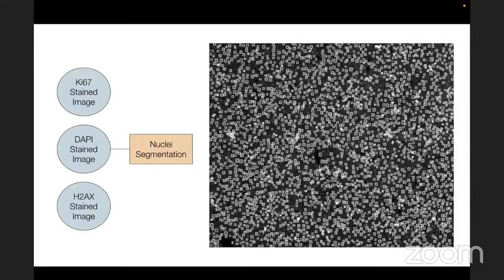All right. The next stage is we're getting into the analysis using different models that Jotherson has created, which is amazing. I didn't have to write them, I'm just implementing them into this plugin. The first stage is the nuclei segmentation stage. As you can see, this picture is very busy, but there are boundary boxes drawn around each of the nuclei. We're able to identify them using a Faster R-CNN network.